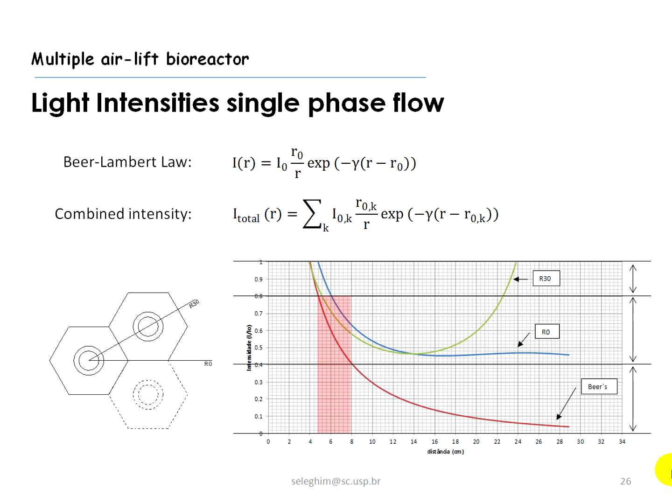Okay, so it's the region between 80% and 40%. If we do the same for the horizontal line here, you see that the useful region is much bigger. Okay, from this position to this position. Now here you have photoinhibition, and along the horizontal line, the R0 region, you have much bigger light intensities, or a much bigger useful region.